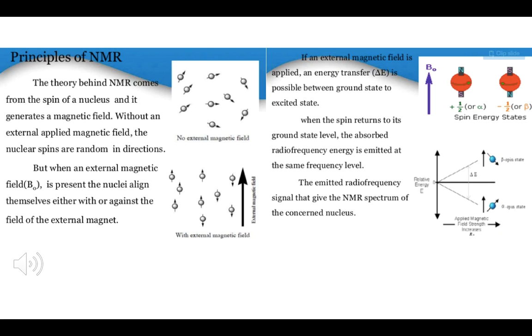And this is good because then we understand what neighboring groups are on these hydrogens. Third, integration. Integration describes the relative ratios of each type of hydrogen. Do we have more methyls, CH3s, than CH2s? Do we have more OH than we have CH3, etc.? And then multiplicity describes how close or far the different hydrogens are to one another.